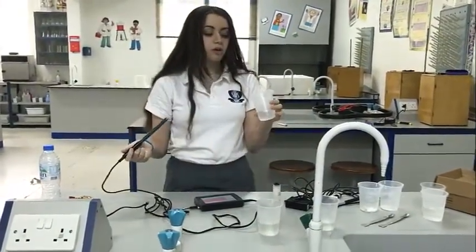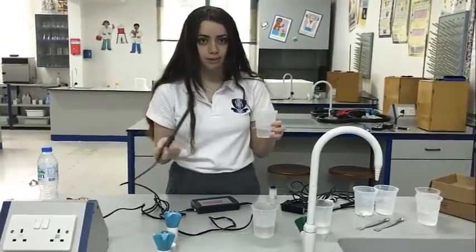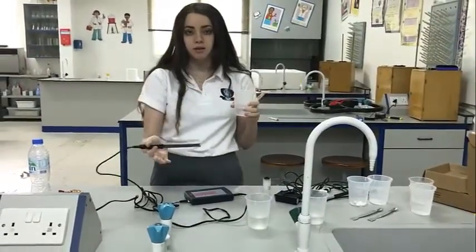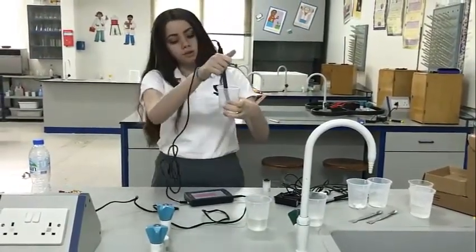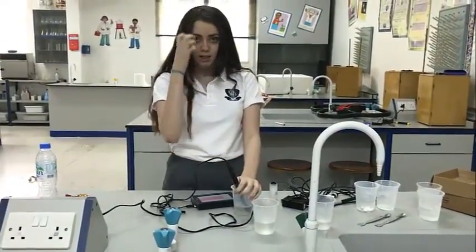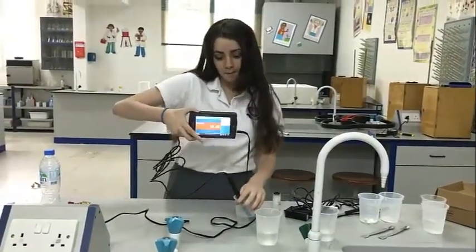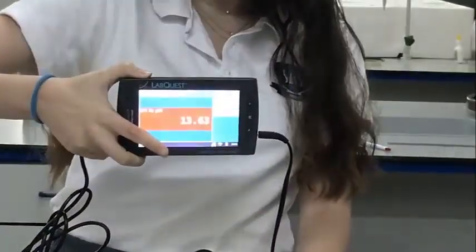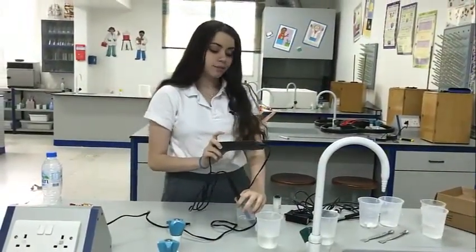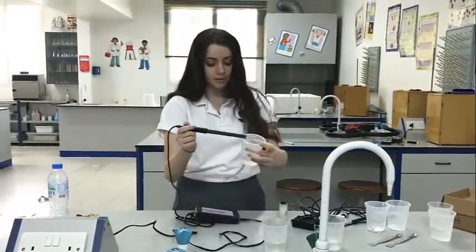So we know a basic substance by the reading. If it's more than 7, it's basic. Less than 7, acidic, and if it's approximately 7, it's going to be a neutral substance. So this is a basic substance, and we're going to make sure by the readings here. It's 13.63, which is more than 7, which proves that it's a basic substance.